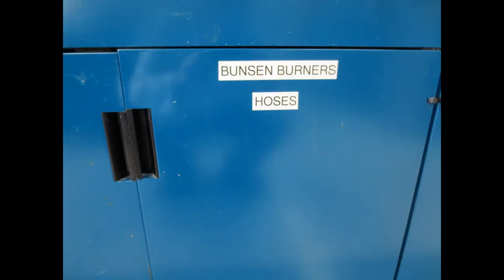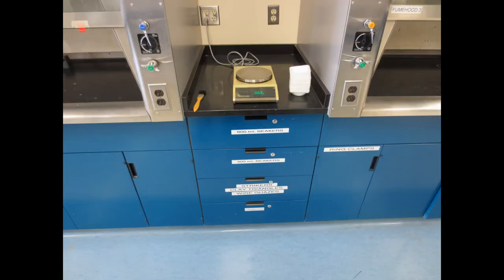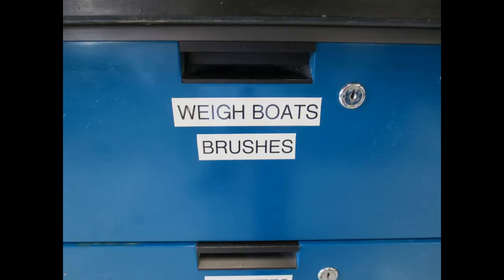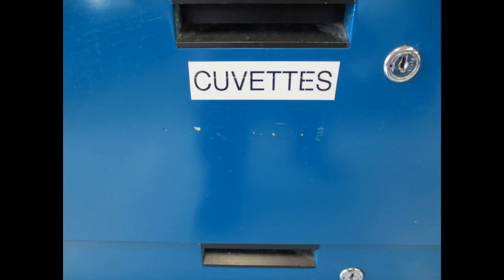Bunsen burners, as well as hoses. A top loading balance, with weigh boats and brushes below. Below this are the cuvettes for the spectrophotometers.